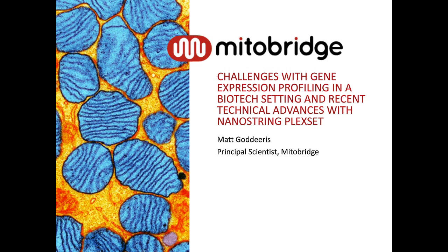Coming into biotech and working at a company that has a pretty tight focus on gene expression analysis, qPCR was really on my mind. I knew about NanoString technology, but at the time, NanoString was able to run smaller sets of data, so it wasn't something we considered when starting the company. We really focused on a very small picoliter scale qPCR system. The presentation today is essentially our decision-making process around purchasing a NanoString system when PlexSet became available, and some of the data that we generated while QCing that system.